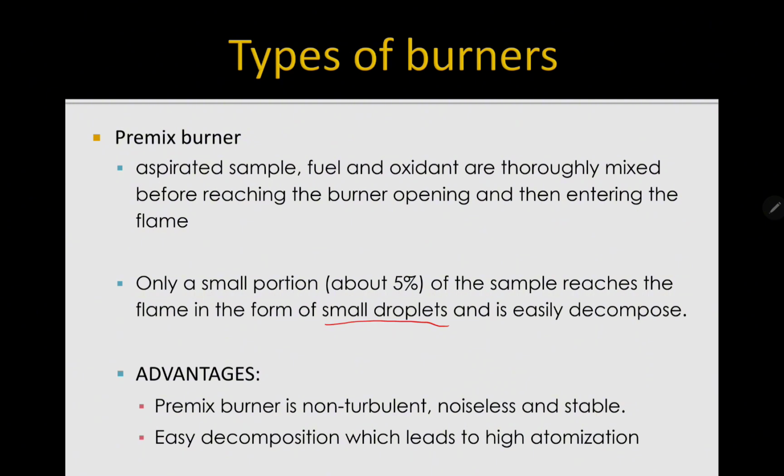Advantages of this premix burner is non-turbulent, noiseless, and stable. Easily decomposition which leads to high atomization.